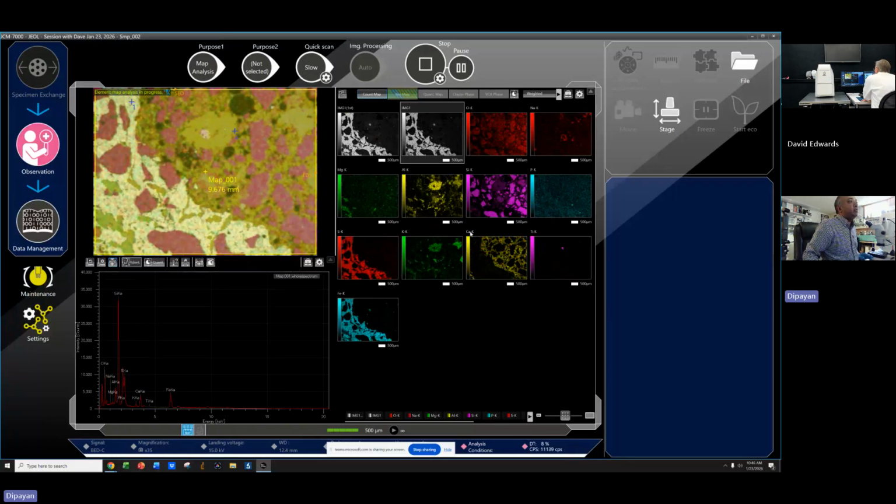See, with the count one, you automatically see a much sharper image. Yeah. If you were going to do that, then we know sulfur and iron are in the same place. So I would make the sulfur either the same color as iron or a similar color, and then the same color when they pop up on the composite.